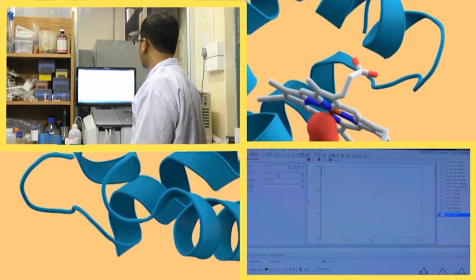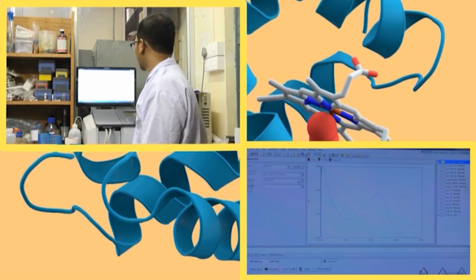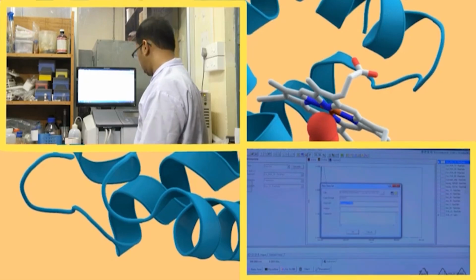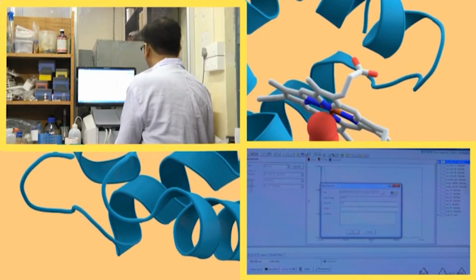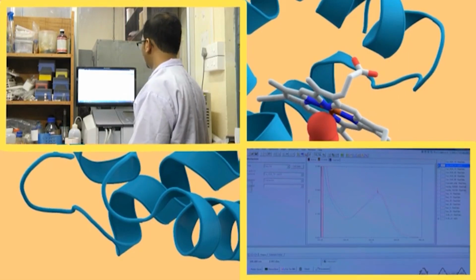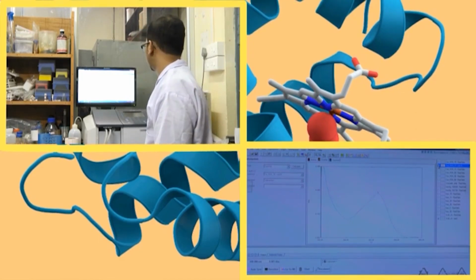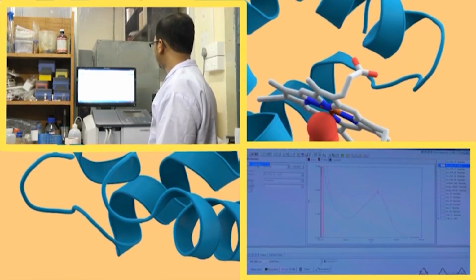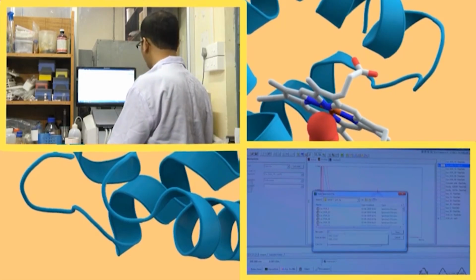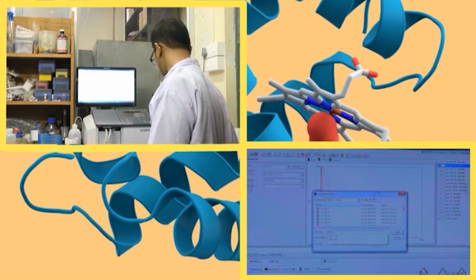The second thing we are going to subtract is curcumin HSA 10 minus HSA 10. Sub 10, again a random name. It gives another value, which is a bit higher than this one. We are saving this one as SUB C 10.